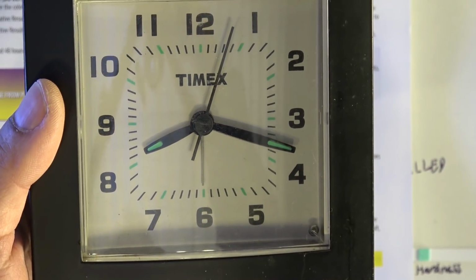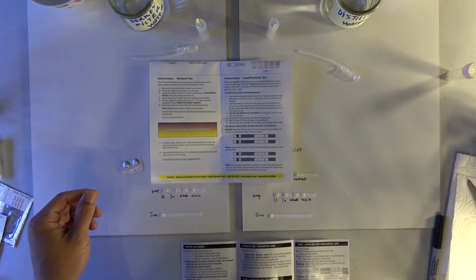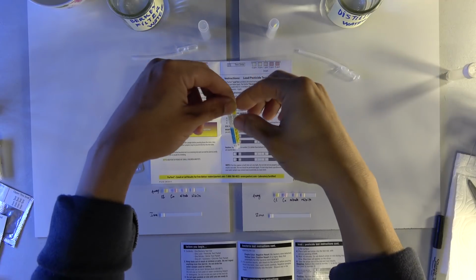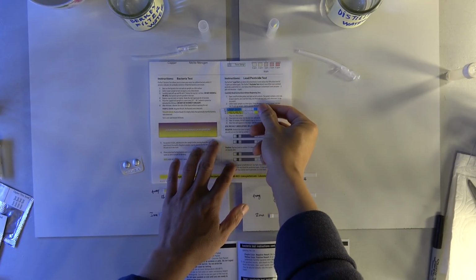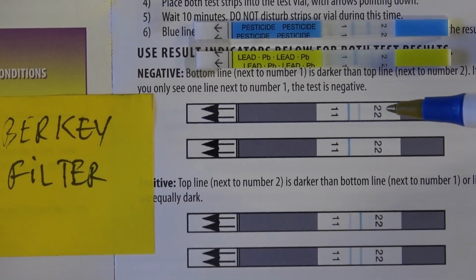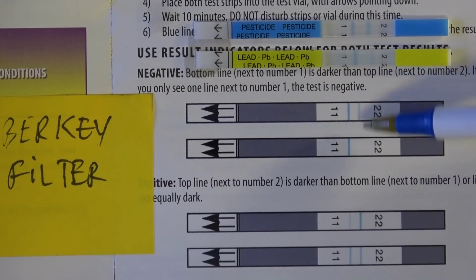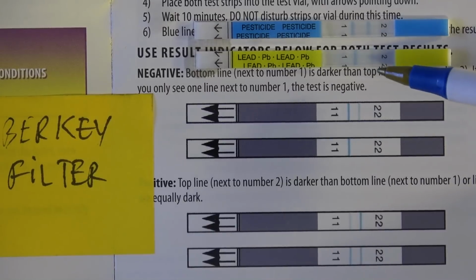Now it's a little bit over 10 minutes now, so time to get the results. First, let's get the Berkey test strip out. See what we got here. Right, let me put it down here. So here we got the test strip for the Berkey filter. The top is a pesticide and the bottom is the lead strip. So for negative results, the blue line on 1 has to be darker than the line on 2. Okay, so the lead is negative, so there's no lead here in the Berkey filter water.